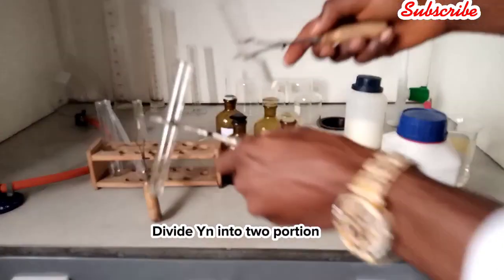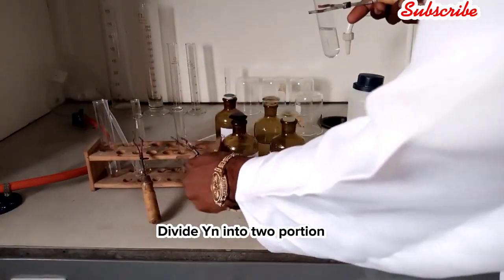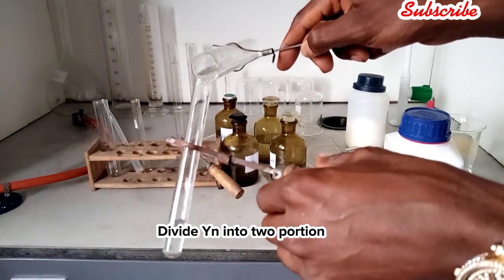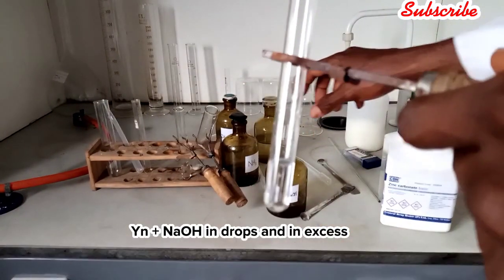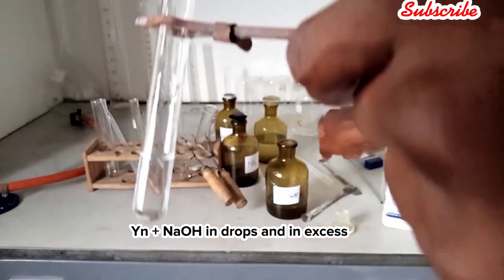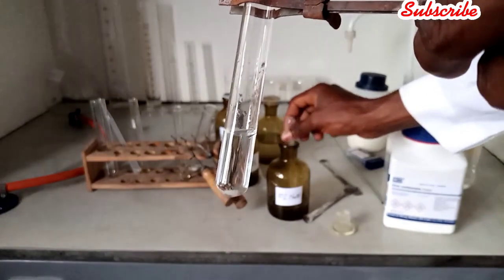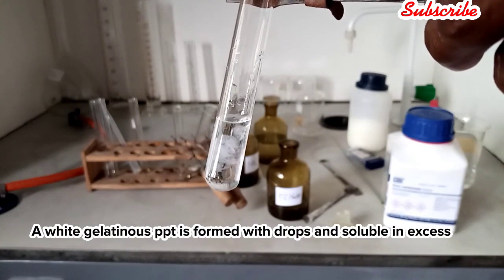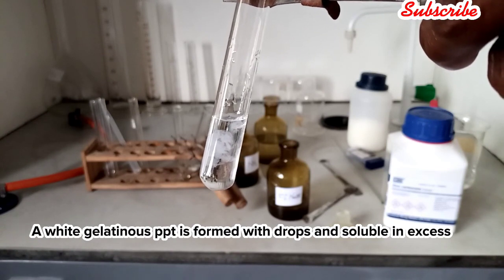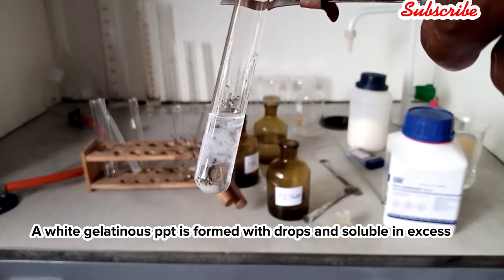So you divide into two portions. Now to the first portion, you add caustic soda, which is sodium hydroxide, in drops and then in excess. You observe a white precipitate is formed in drops, and in excess it dissolves to give a colorless solution.